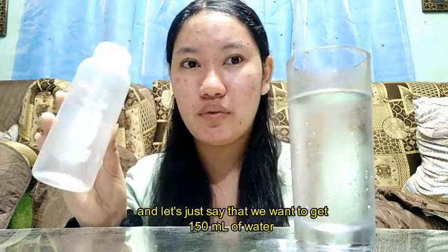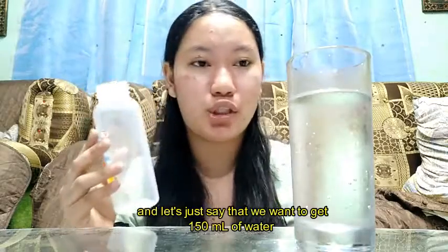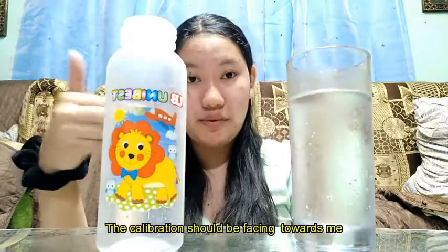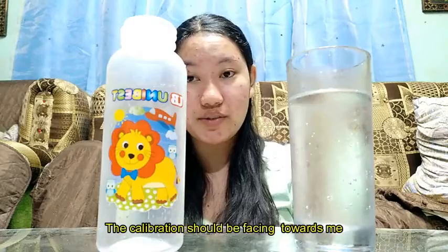Let's say that we want to get 150 ml of water. We will be transferring it like this — just put it here, and the calibration will be facing towards me.